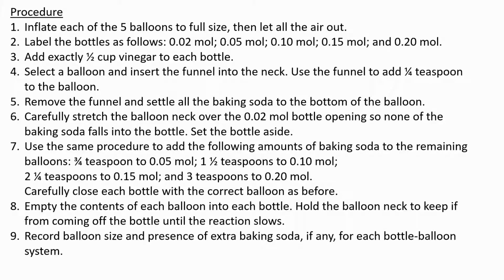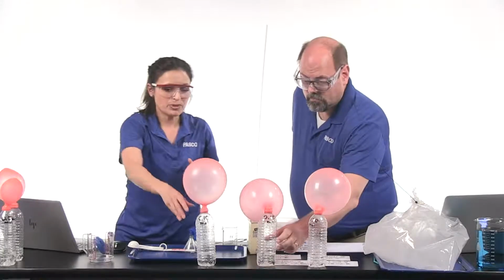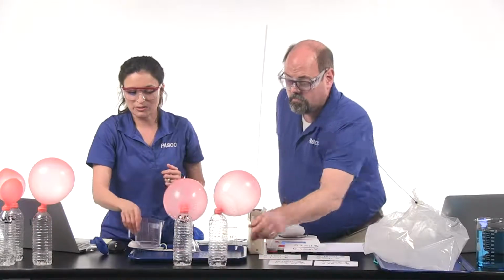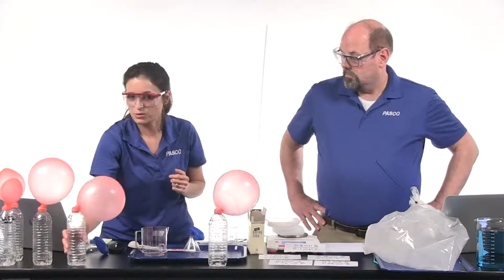Okay, so that's something you can do at home, and I have up on my computer screen right now just the procedure that I went over. It's everything I said out loud. But there is a lab that you can do in the classroom with a pressure sensor if you wanted to do a quantitative analysis of the mole ratio in a reaction. I'm going to set these aside.